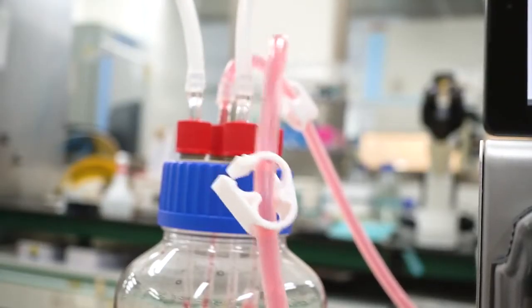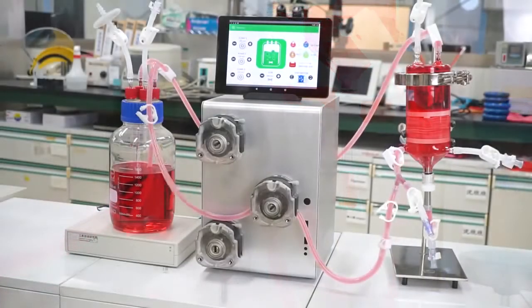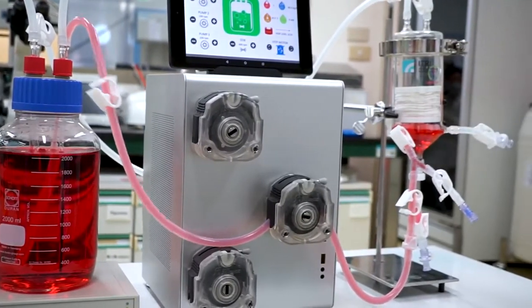EITRI has developed disposable cell mass production bioreactor technology that features a high efficiency cell culture medium. Huge amounts of high quality cells can be produced at one time.